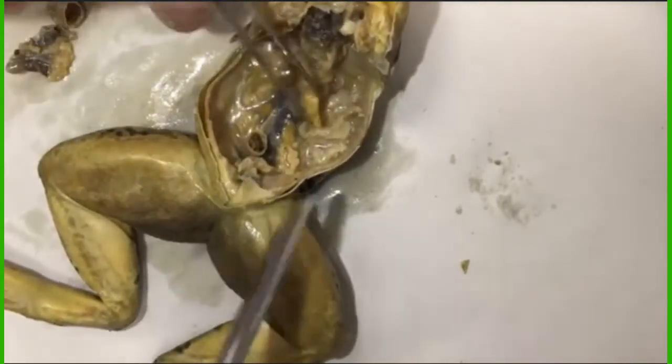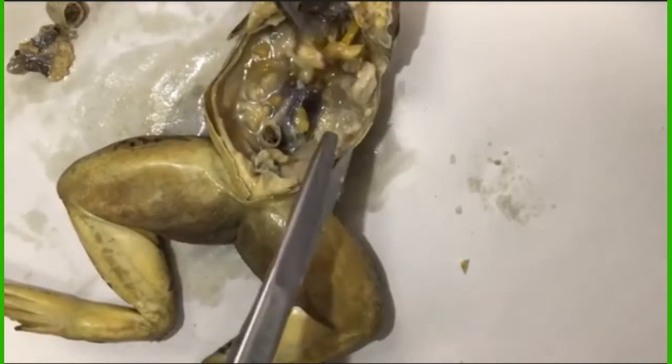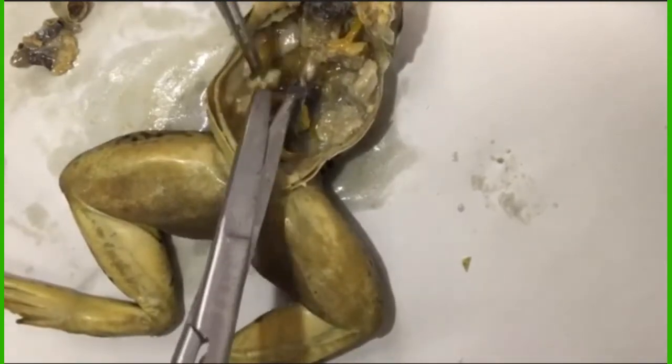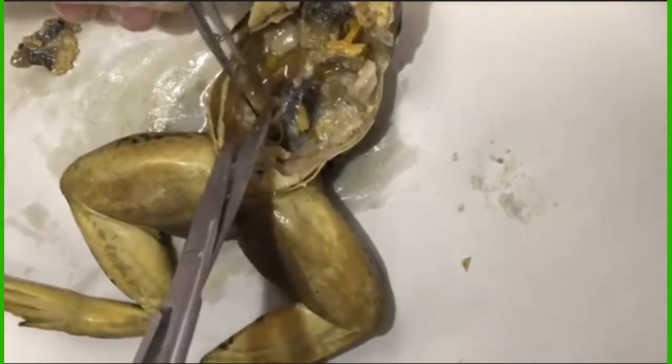And I'm cutting spleen and other tissue that's just connective tissue out of there. I want you guys to be able to see the kidneys, so that's where I'm getting to. There's a little bit of fat that was left over. That right there that I'm cutting right now, that little tube, curly, windy looking little tube, that is the oviduct. That's where the eggs pass through from the ovary out their cloaca.